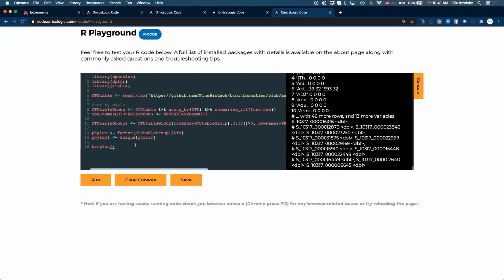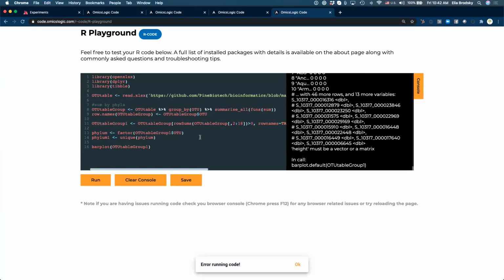All right, great. So yeah, let's put here OTU table. Let me just copy this. So this is what we want to use to bar plot. So let's just run this. Okay. Height must be a vector or a matrix.